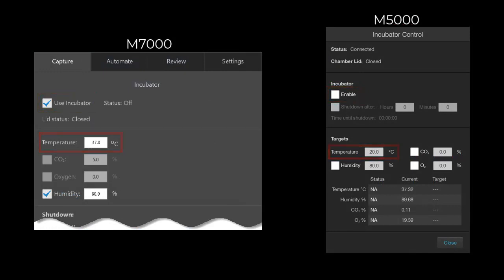Select and define CO2, oxygen, and or humidity percentages if applicable.